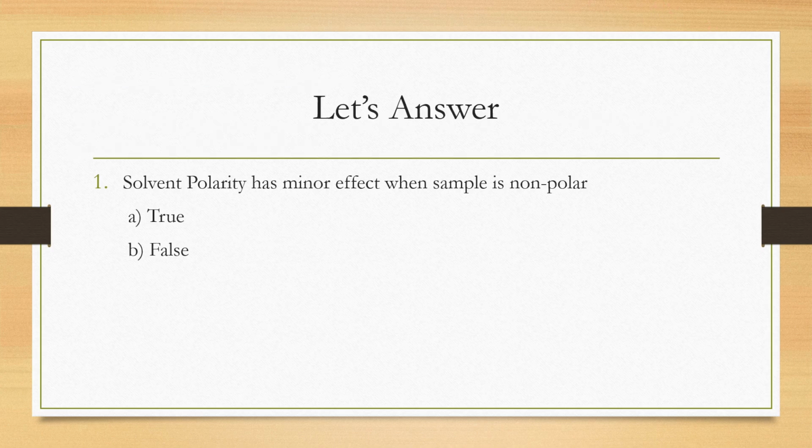Here let's answer a few questions related to this topic. First one, solvent polarity has minor effect when sample is non-polar. You can pause the video and guess the correct answer. This is true. Solvent polarity will have minor effect when that sample is non-polar.